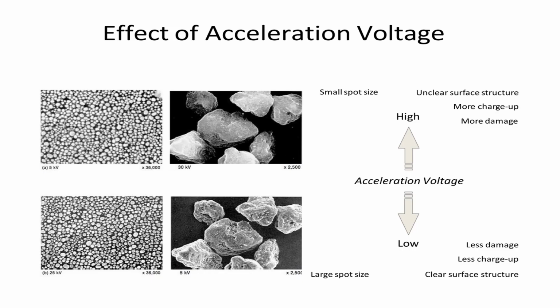Now, the effect of accelerating voltage. If we use a high accelerating voltage, we get an unclear surface structure. That means more damage in the image.